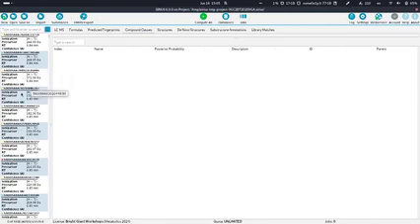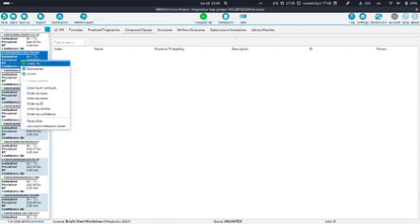Okay, now let's try to do some computations. What you will notice, you can just click on any compound and then right-click. You will have a context menu, and there will be also an option to compute if you want to compute something for only a single feature.